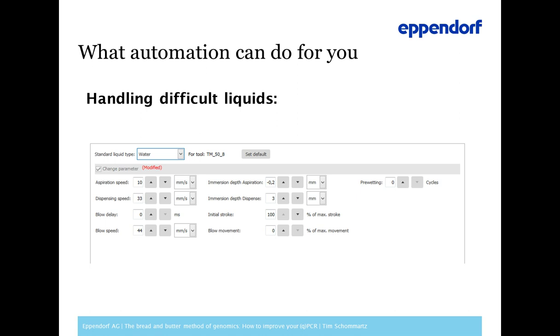Good question. It's not an easy answer. If you go for a regular PCR, it doesn't matter. So it can be transparent. It can be white. Because there is no actual detection step involved in that.